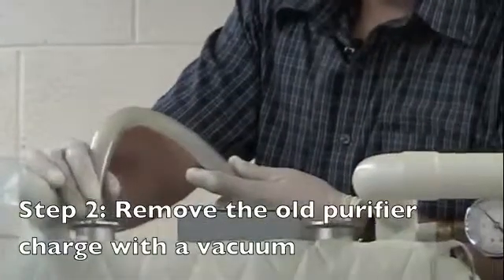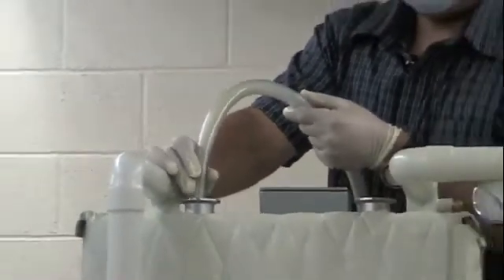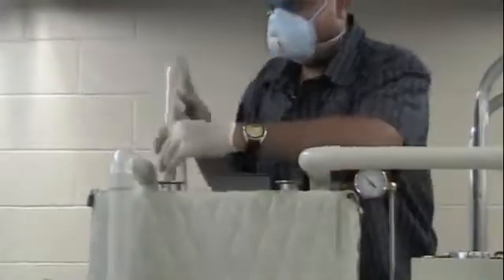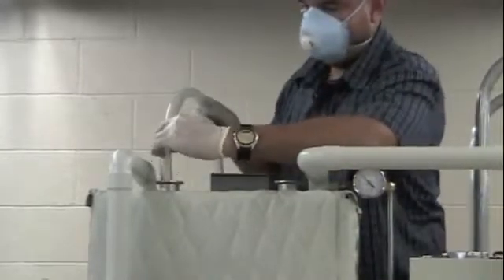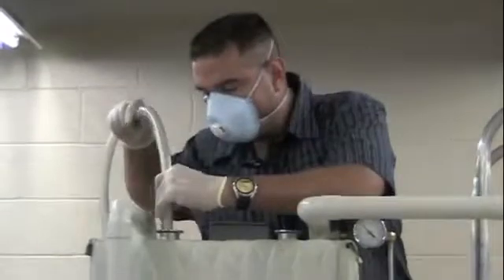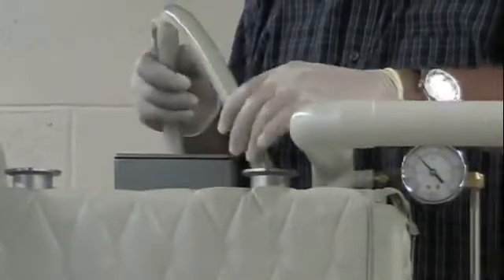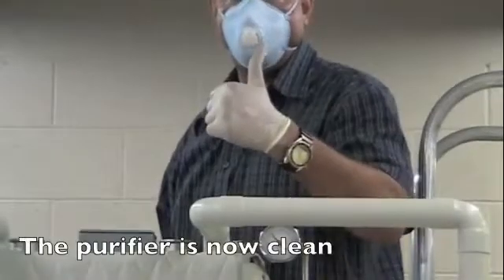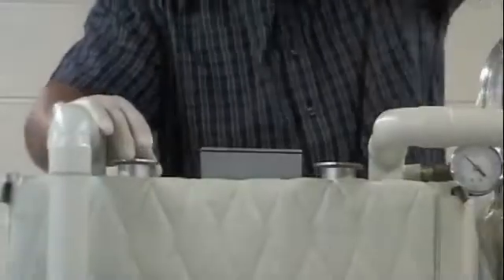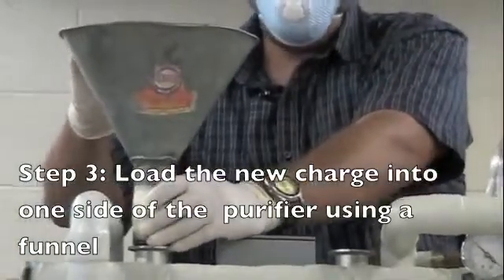Remove the old catalyst material from the purifier using the vacuum cleaner. Now that the old purifier charge has been removed, we will begin to load the new one using a funnel.